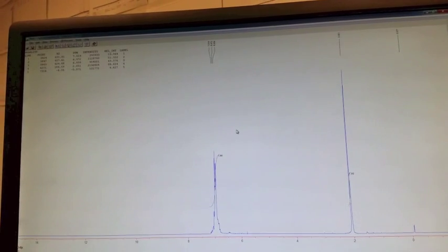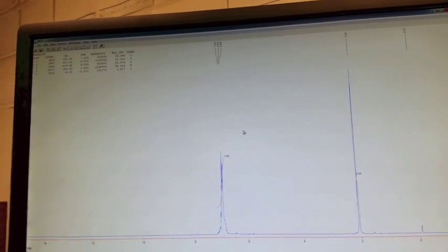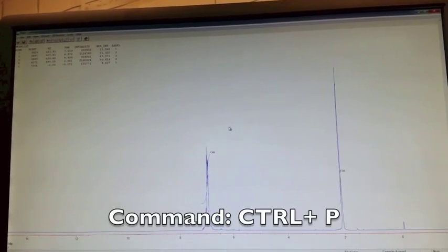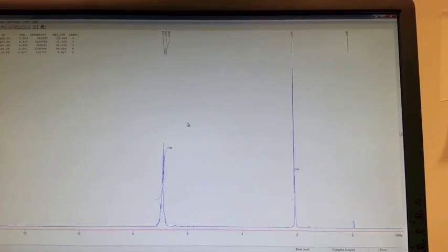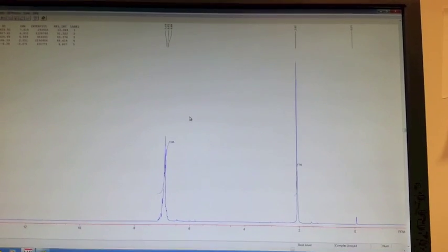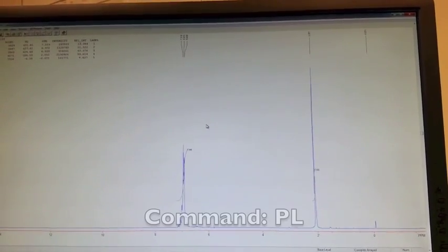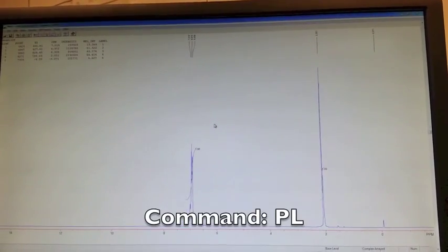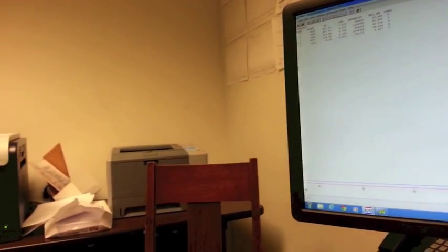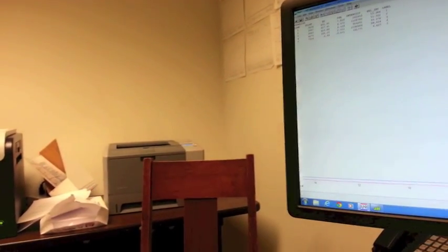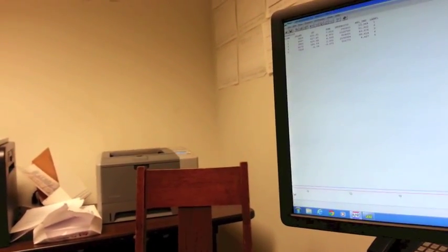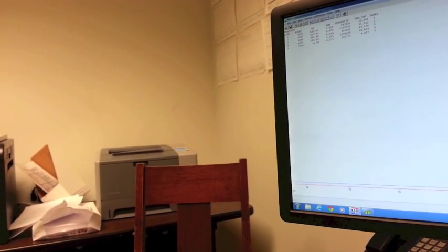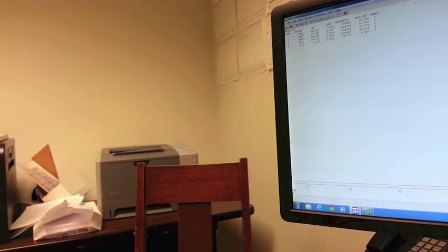To bring up the table, you want to hit Ctrl-B. That will bring up this nice little table on the side for you. If the peak labels had disappeared, to bring them back, you can hit Ctrl-P. Then the last thing you want to do is print your spectrum. Just like before, you want to hit PL, and that should print it. And that's it.